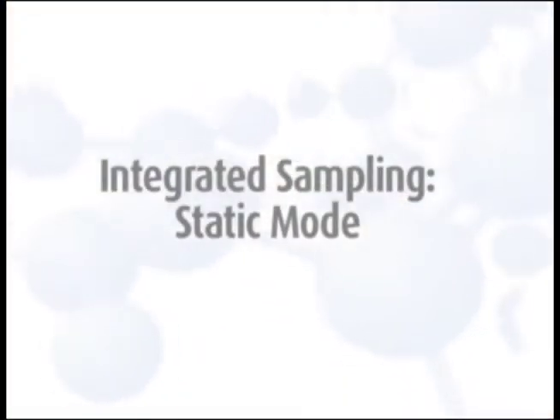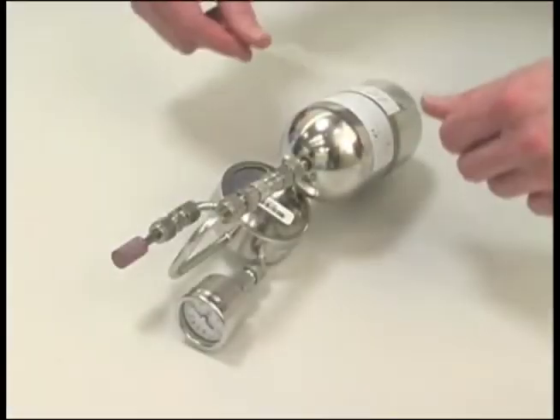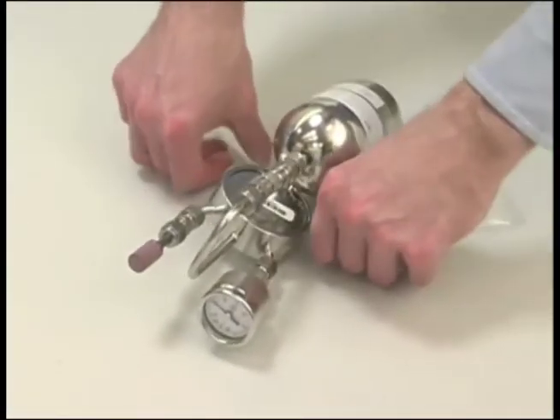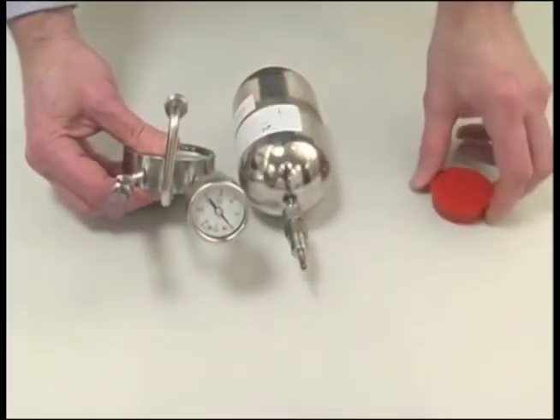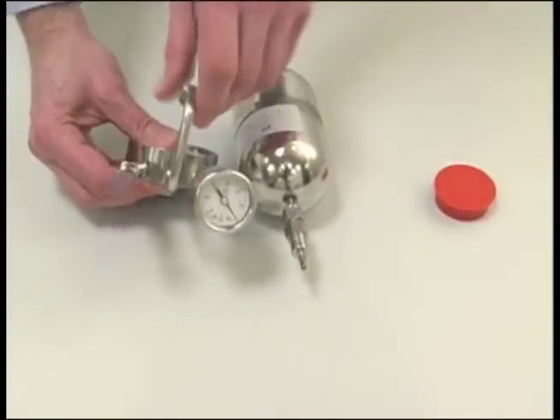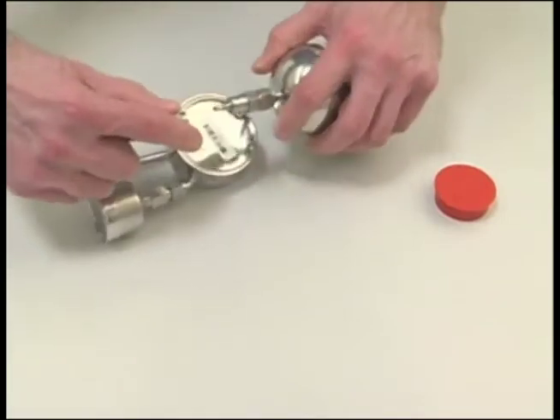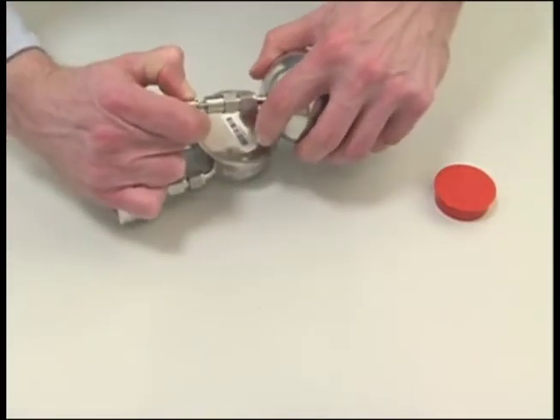Take the can and regulator to the sample location. The can should be placed and secured where you would like to collect your sample. Remove the can's protective cap from the can's inlet stem. Pull back the collar on the regulator and insert the regulator into the can's inlet stem and release the collar.